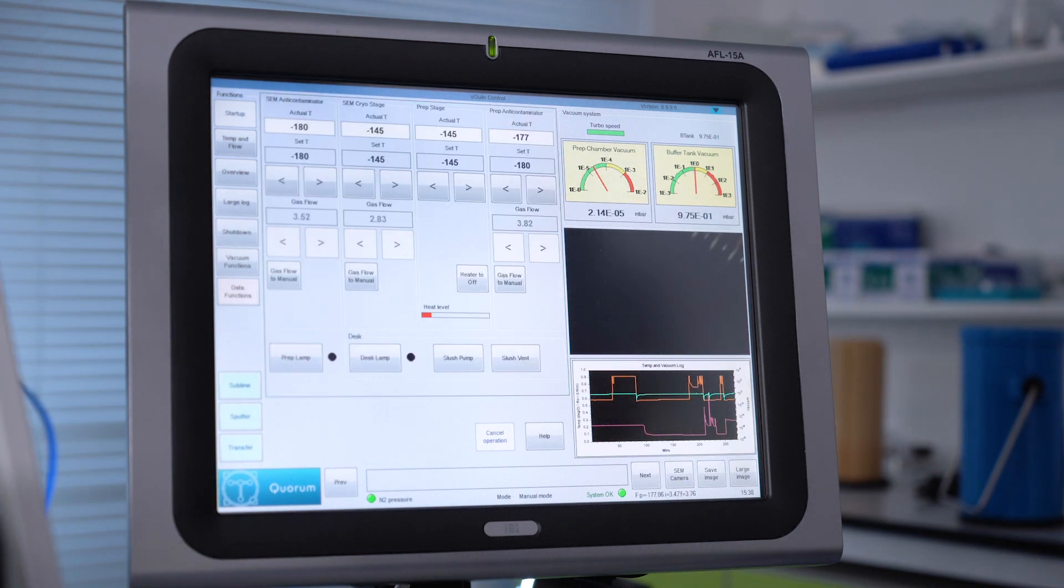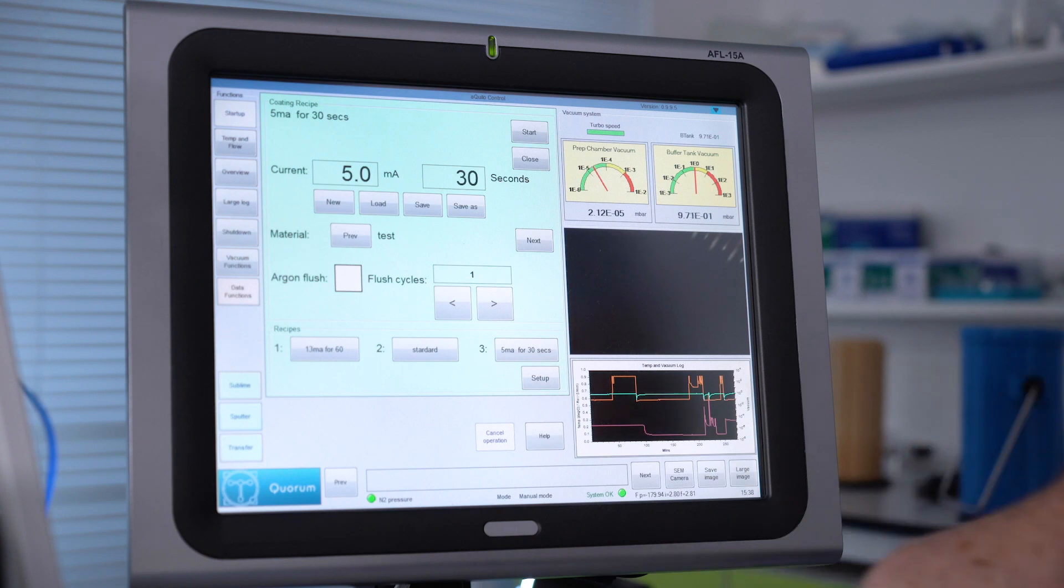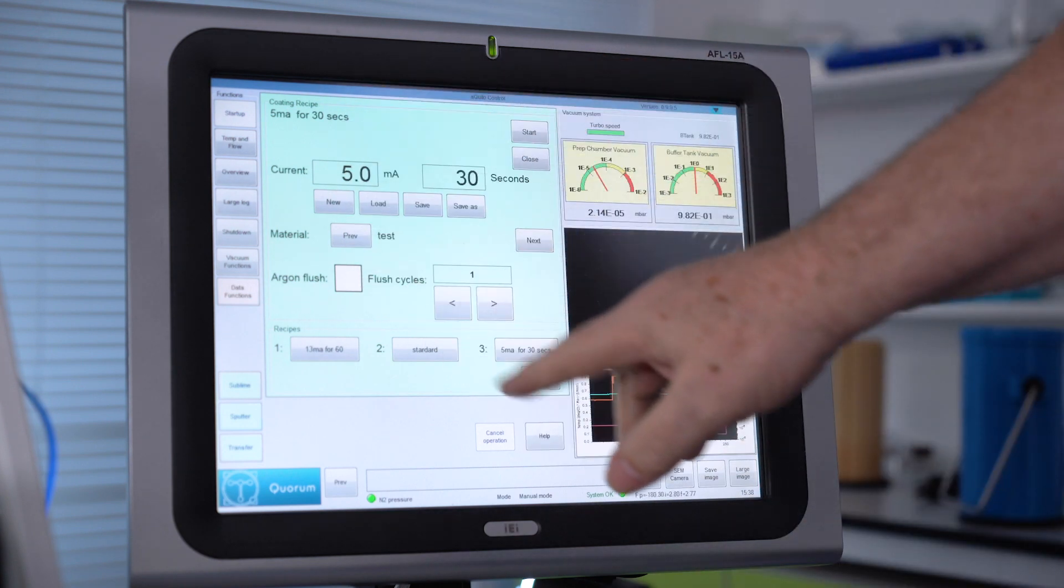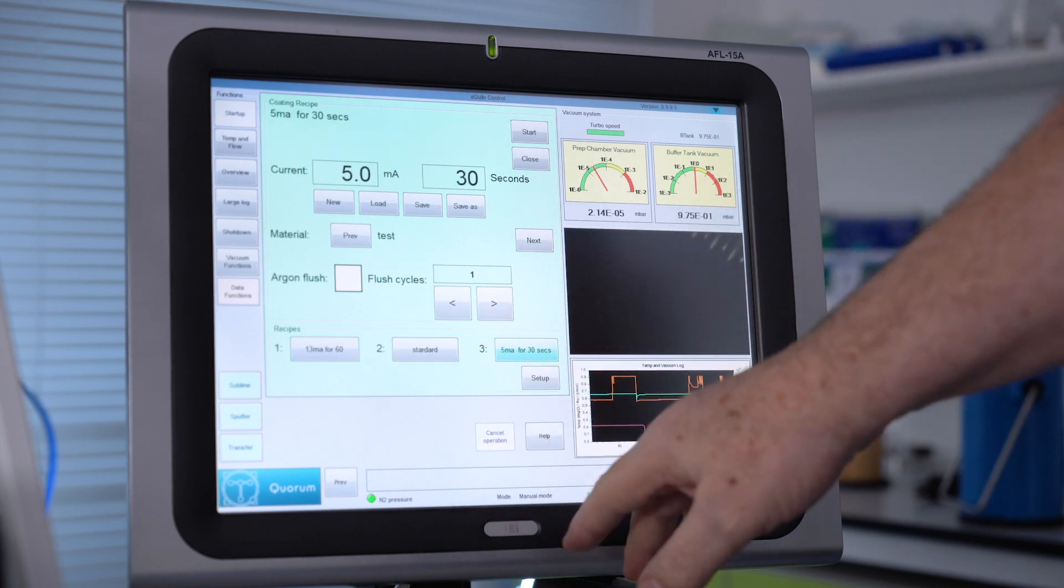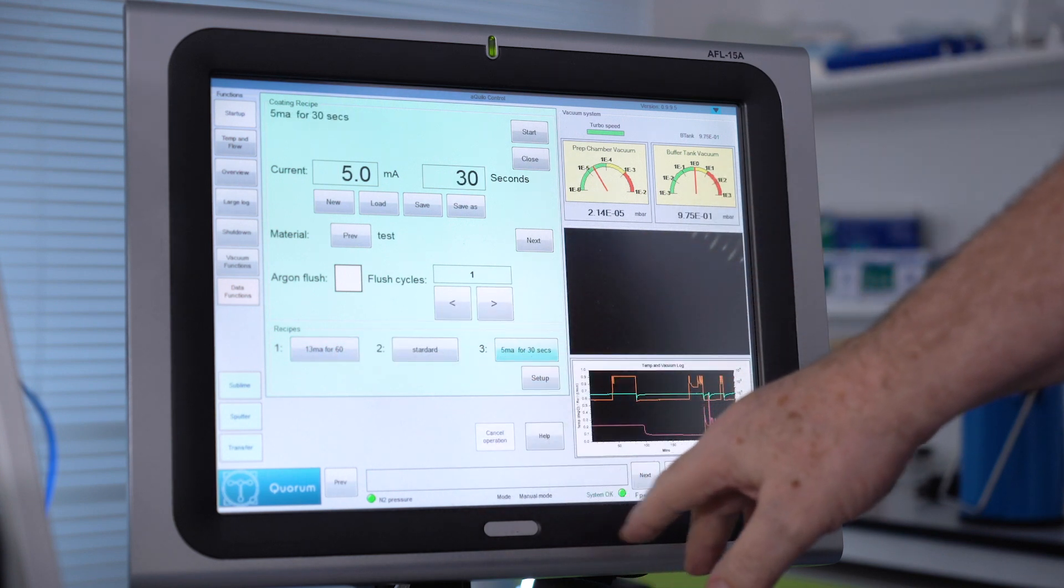Now we've sublimed the sample, we'll go to sputter to coat the sample. Here we see it defaults to the last recipe we used, but we can choose different recipes from these quick choice bars and we're ready to go.